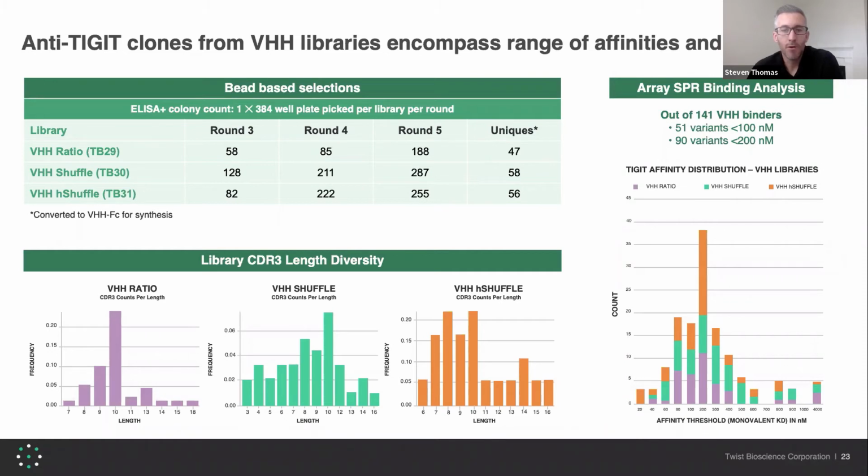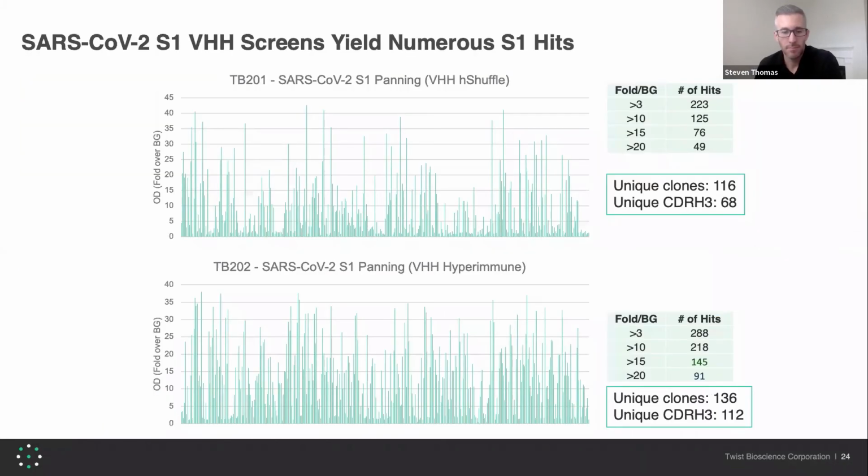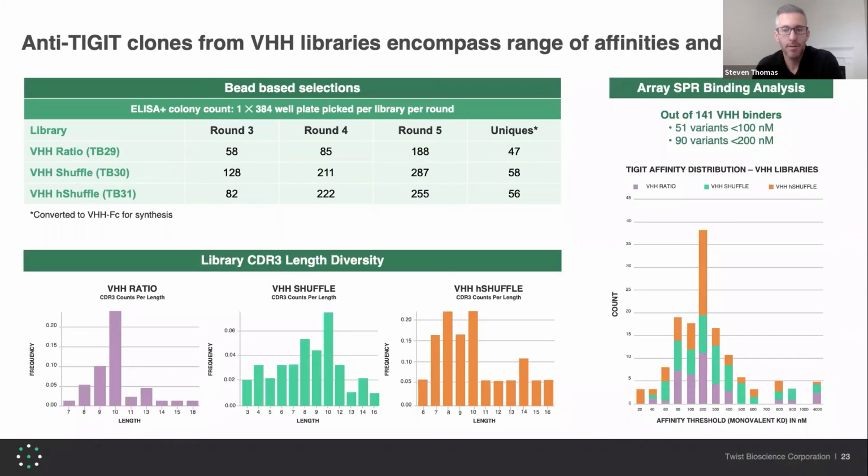This is post-panning data, demonstrating the CDR3 length distributions, which confirms the diversity of the library. Many of the antibodies shown here possess long llama CDR3s, which could potentially provide exceptional contact and binding into deep antigen channels. Sorry, did not mean to progress there.